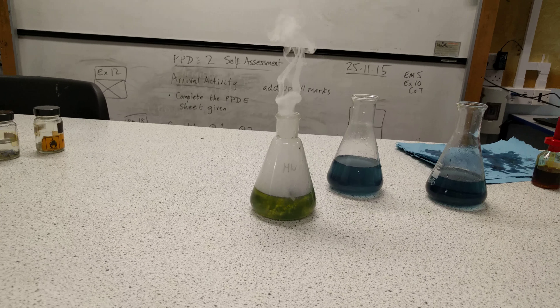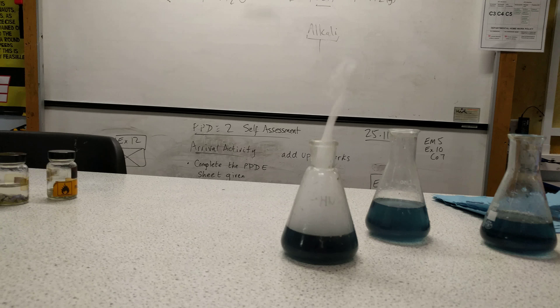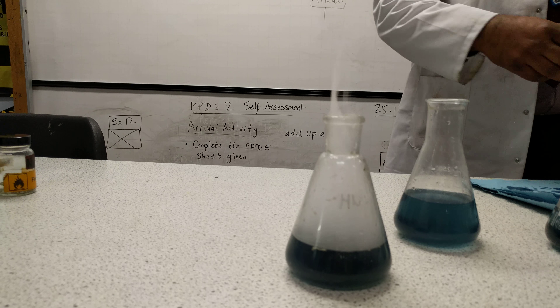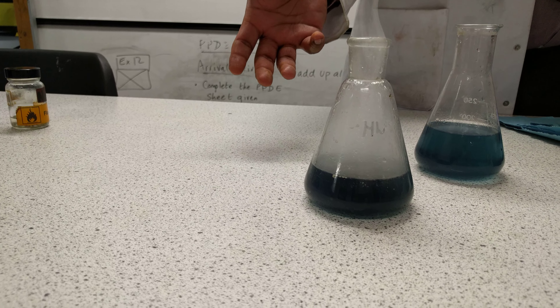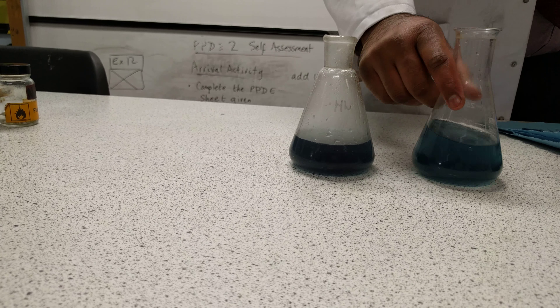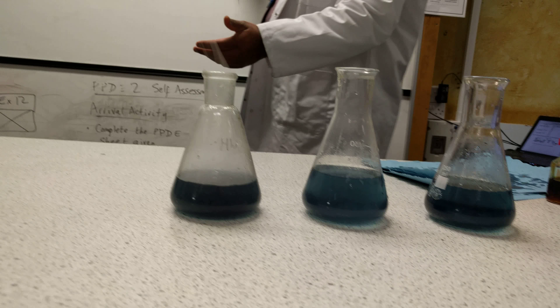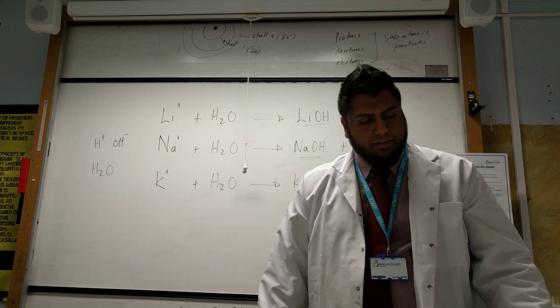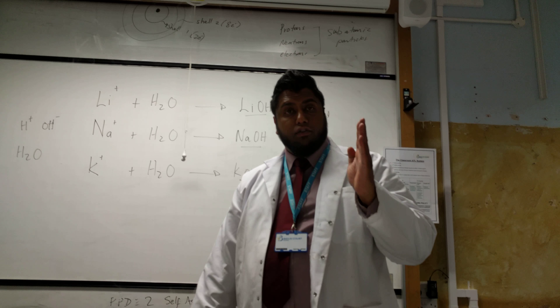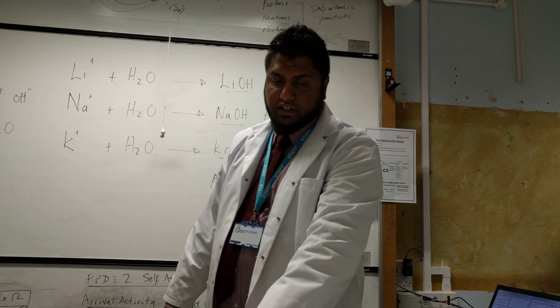Lots and lots of hydrogen being formed — a very vigorous reaction with lots of heat given off. You can notice a lot of popping and the amount of hydrogen just being created. Also, it's not just hydrogen — it can also be steam, because water is vaporized by the heat, turning it into steam as well. You saw the flame in there. The alkaline solution is much darker compared to lithium and sodium because it's more reactive. What we formed is potassium hydroxide, which gave off hydrogen gas. Remember: an alkali metal reacts with water, forms a metal hydroxide, and releases hydrogen gas. Hydrogen gas produces a squeaky pop noise, and the universal indicator shows the color change.